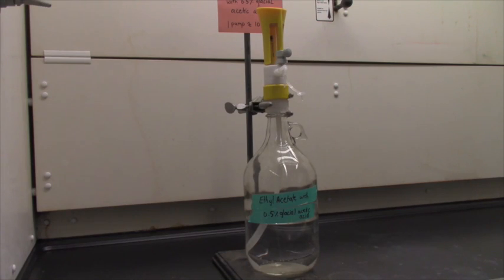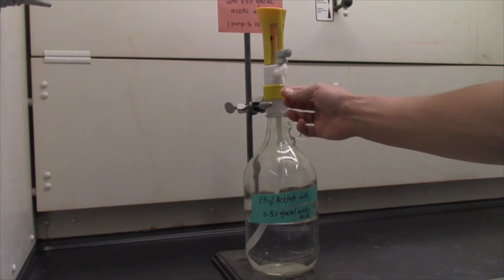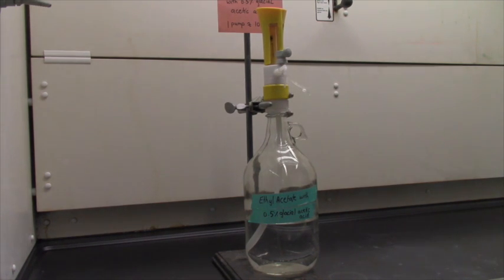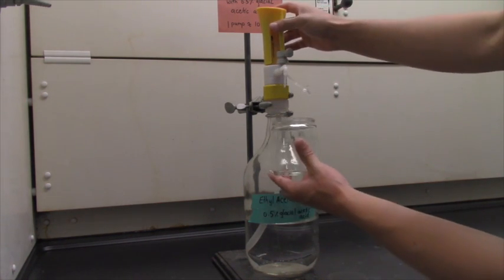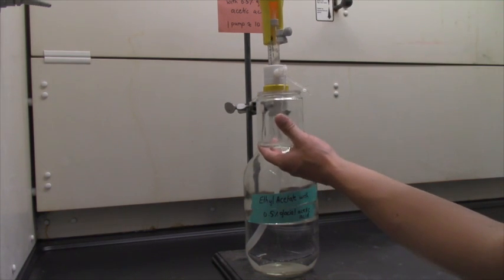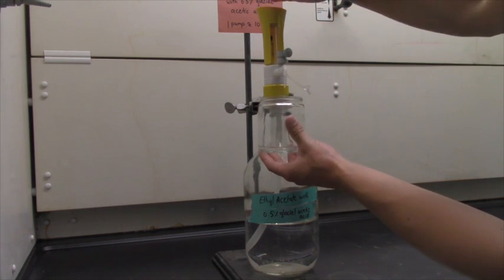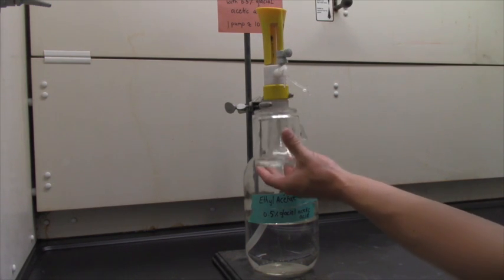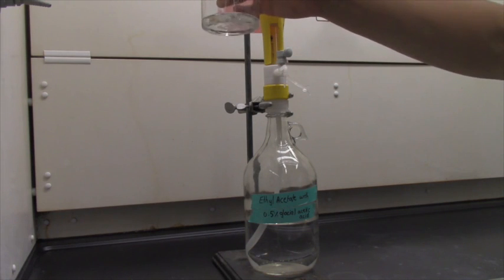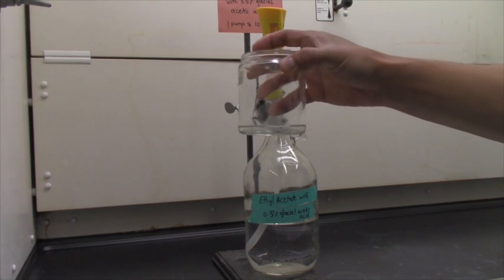So what we're looking at here is our solvent solution that we're going to be using to develop our TLC plates, and it's attached to a dispensing pump. One thing about the dispensing pumps, there's this little cap that you need to remove before using it, and to use this properly, all you're going to do is lift up on the dispensing pump, and then you can really just let go and allow that to dispense the solution into your jar. You never really want to push down on these or force them. Just try to be gentle with the dispensing pumps.